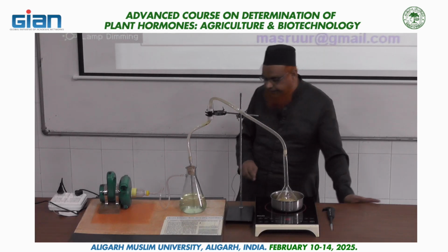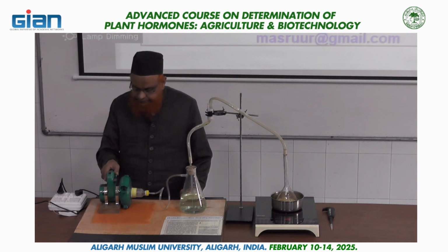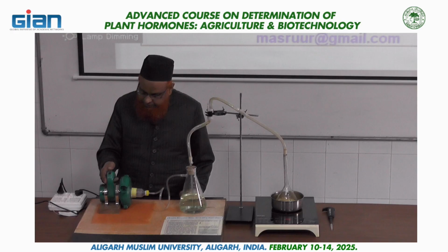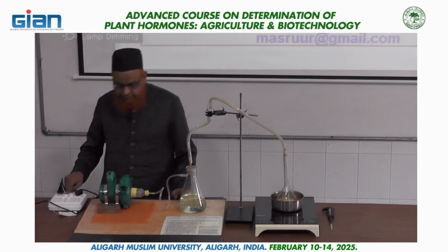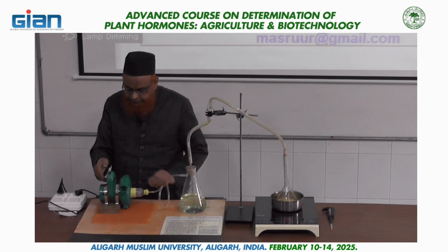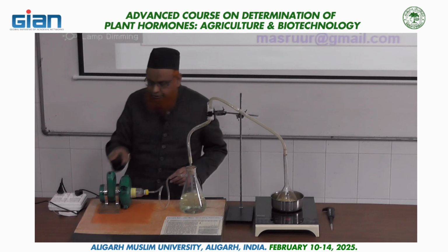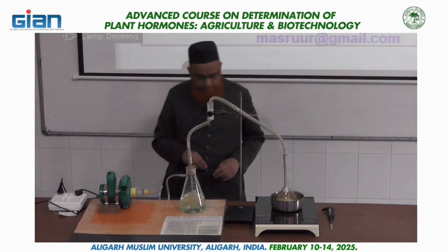And then we'll turn on this vacuum pump, and here is the button for the power supply, and then we have to turn it on. You can lock it also. You see?